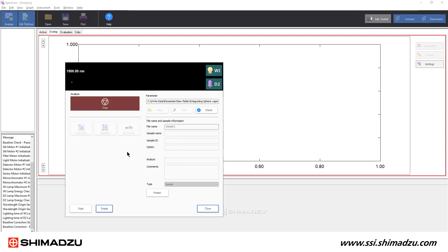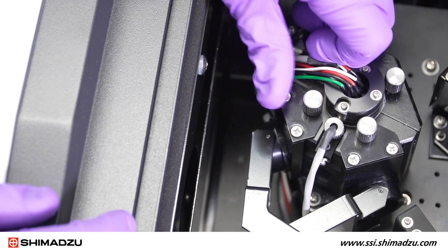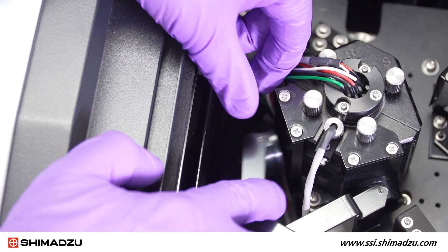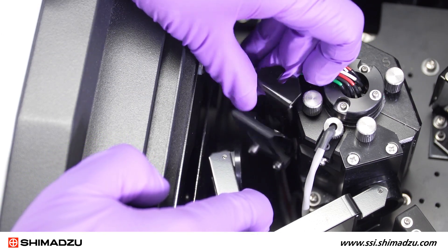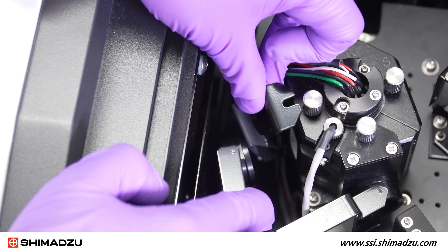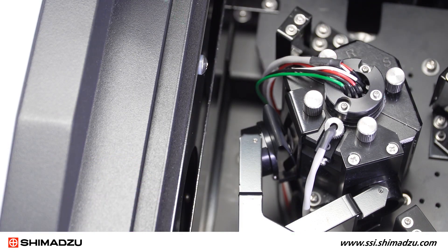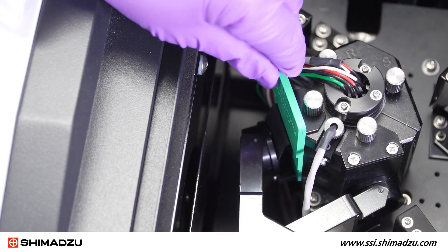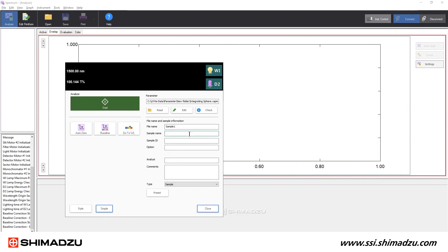Once the baseline measurement is complete, remove the white plate from your sample position. Using the proper holder, install your sample into the sample position of the integrating sphere. Verify again that the proper sample information is entered into the instrument control window, and press Start to begin your measurement.